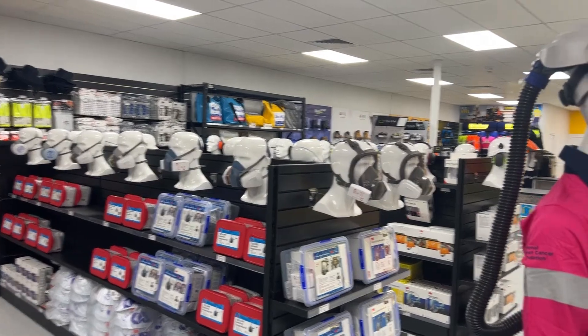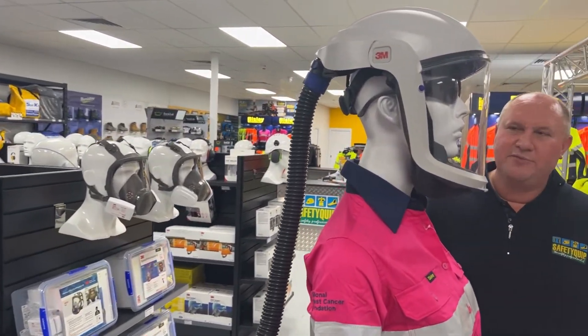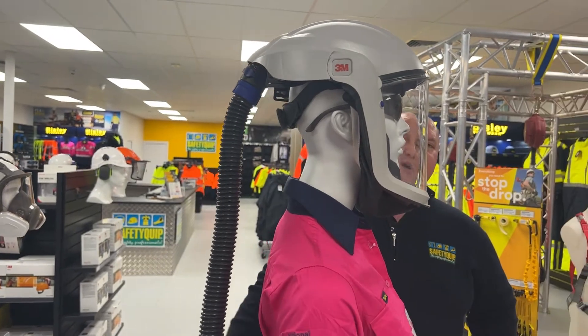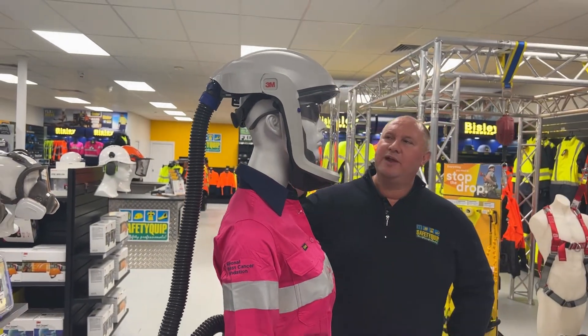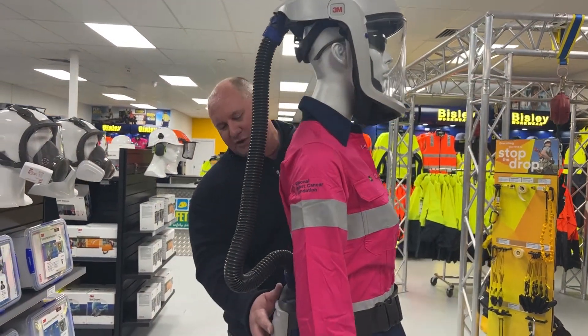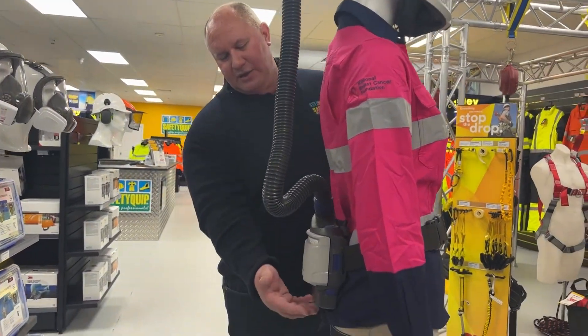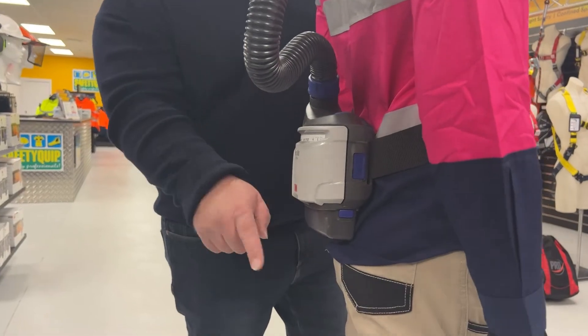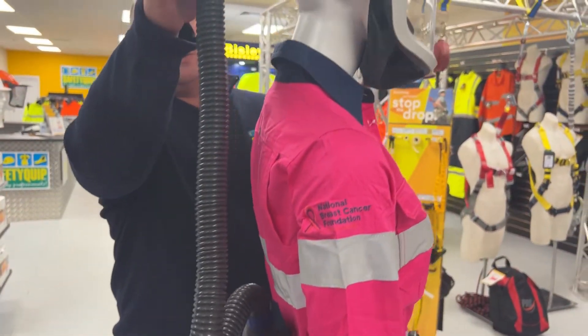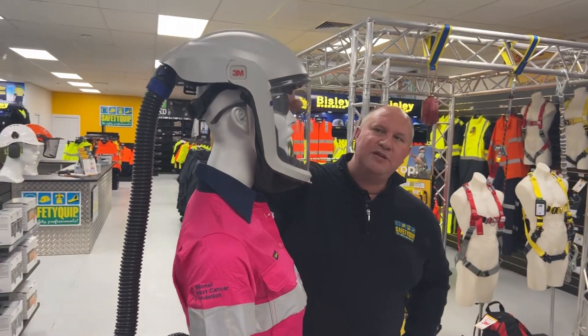This one is what we class as a positive pressure respirator — it's a powered air purifying respirator, or PAPR for short. This one is the 3M brand, it's the Versaflow. The product consists of a motor or blower down here that filters air; there's a filter at the bottom. The filtered air comes into the unit, draws up through this hose, and is forced into a face piece or head piece at the top.